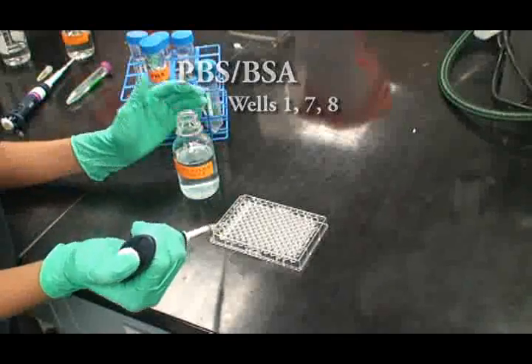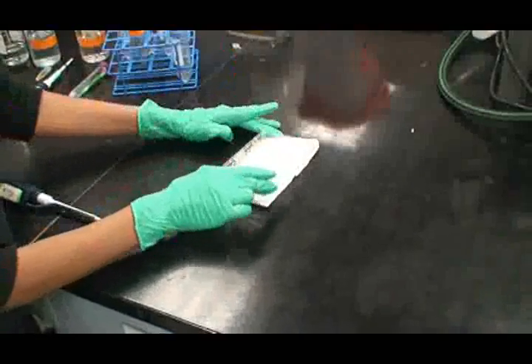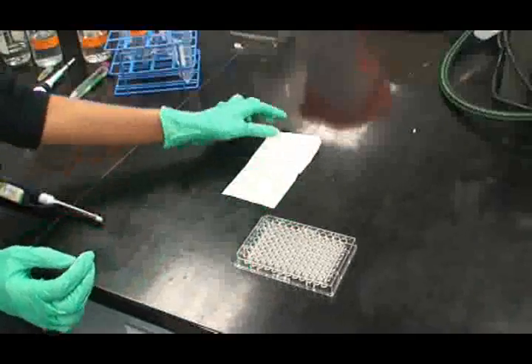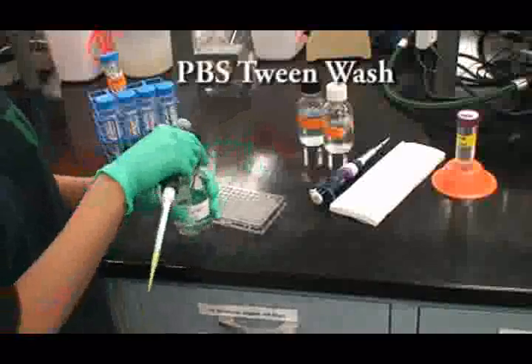Incubate for 30 minutes at room temperature. Empty your wells by inverting on a paper towel. Wash the wells you are using three times with 200 microliters of PBS-Tween wash solution. Empty the wells again on a paper towel.